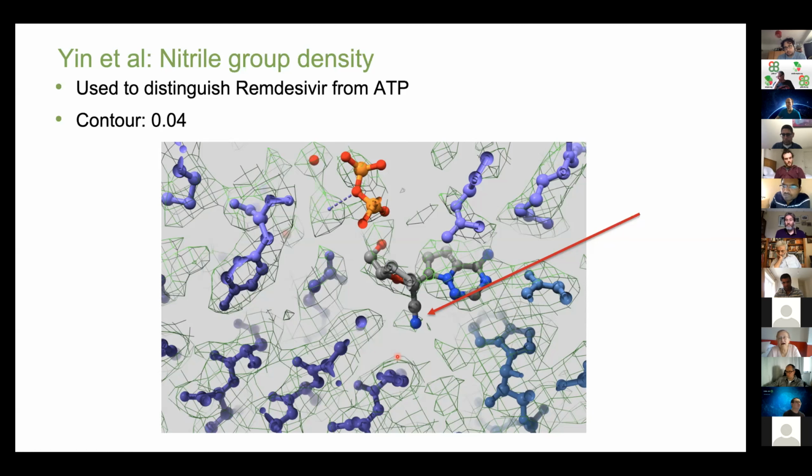And if you take half maps, even by random, each of them will have an angular preference in distribution of angles. Therefore, in this direction, correlation will be quite good, but in the perpendicular direction, it will fall down. Local resolution will not provide you any additional information, because both maps are suffering from the same problem.